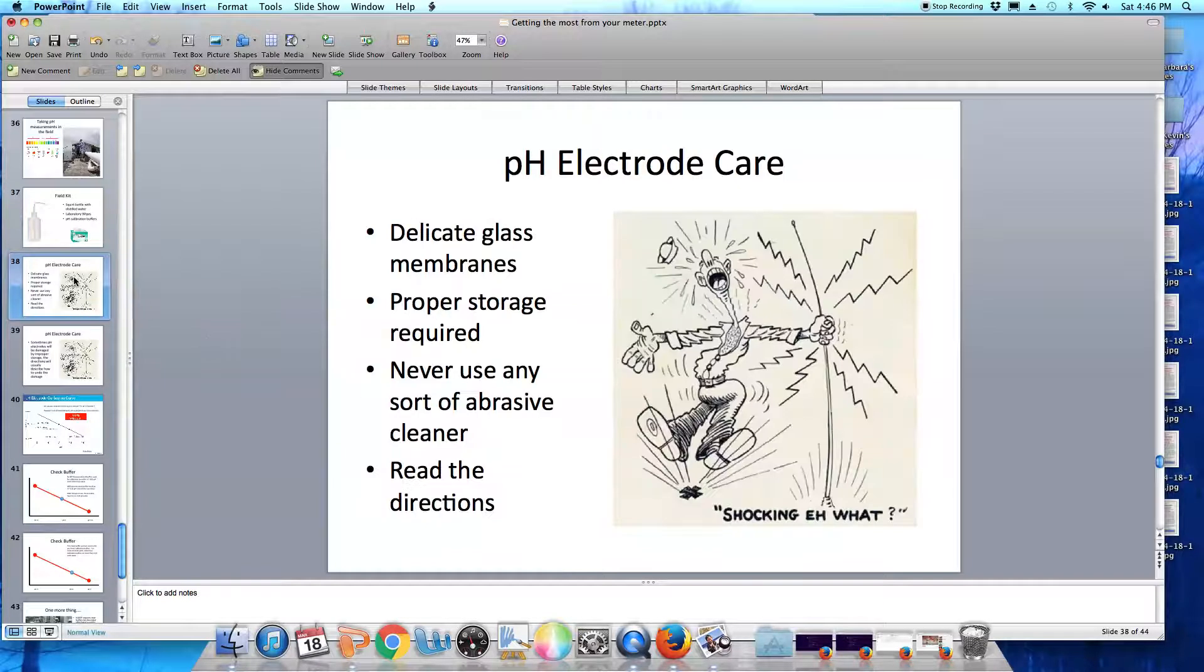Let's begin by talking about how to take care of our pH electrode. Your pH electrode has a delicate glass membrane that will allow hydrogen ions to migrate from your water sample inside the electrode and generate a millivolt signal. Proper storage of this electrode is required to protect that delicate glass membrane.